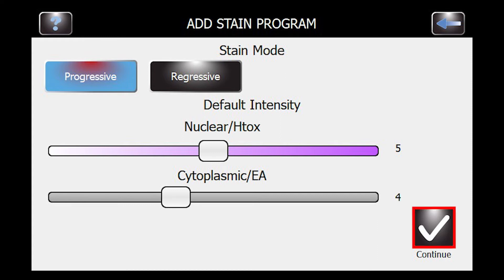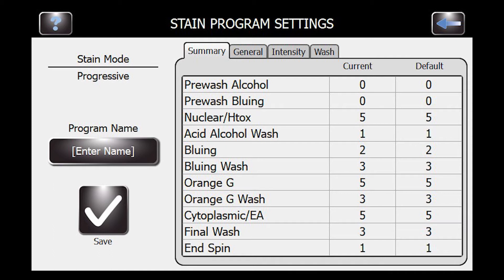This will take you into the menu that has all of the settings. There are 11 different settings that you can work with to get staining customized to meet the user's preferences.